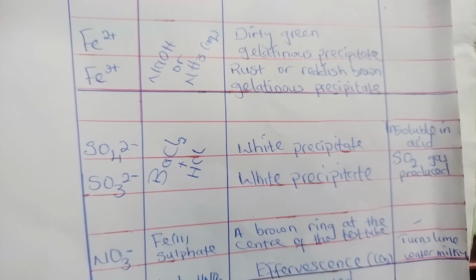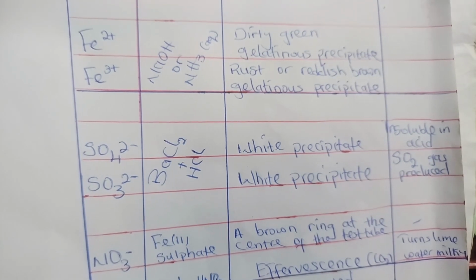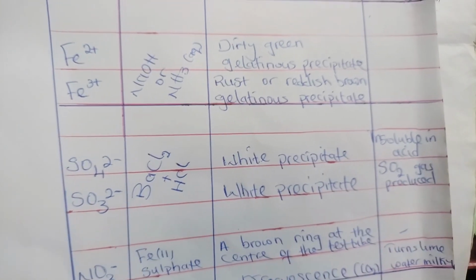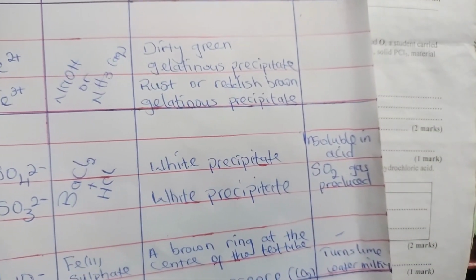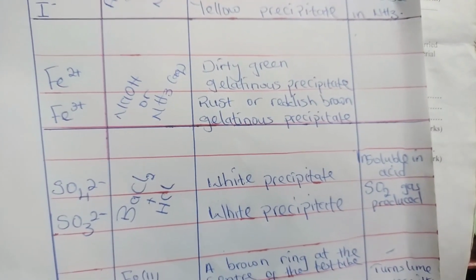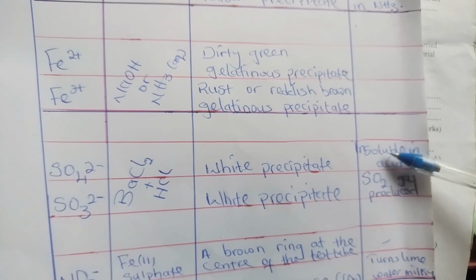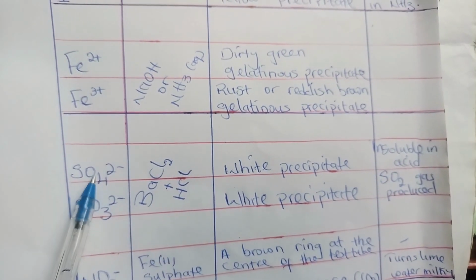They cannot just say a white precipitate is formed and end there, because the sulfate ion gives a white precipitate, and the sulfite ion also gives a white precipitate. That's why they went on to tell us that the precipitate was insoluble in excess acid, and that will give us the presence of the sulfate ion.